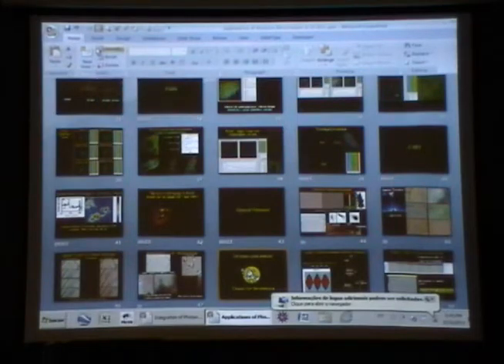The point is that he's buying a new Zeiss microscope as well. So let me ask you a general question. You show lots of beautiful images of very fine microstructures. To what extent do you have to stabilize the living organisms so they're not moving around? And how do you do that?